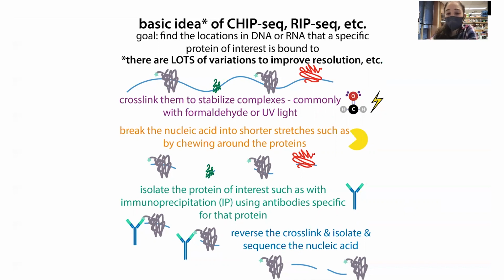Methods use formaldehyde and other linkers for linking it to DNA. A common version of this is ChIP-seq, and this is often used to study regions of DNA that have different levels of transcription, or different levels of various factors bound.